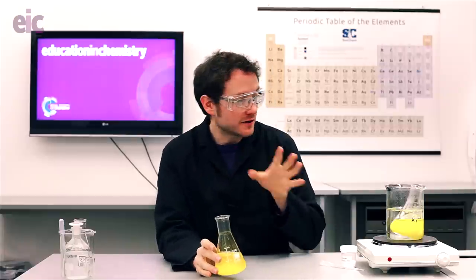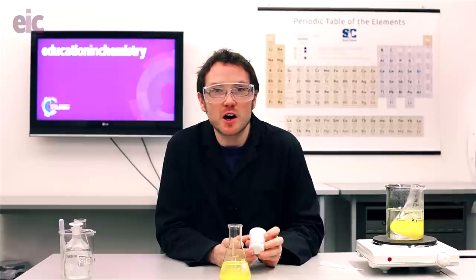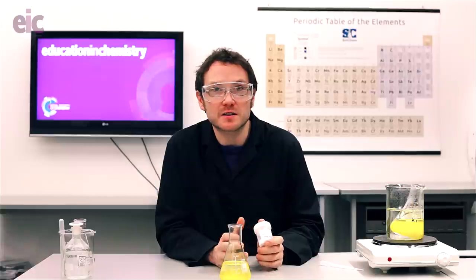Now, just talking very briefly about cleanup: when you've finished experiencing and enjoying that glittery goodness, your best option is going to be to add an excess of sodium carbonate. That's going to help to precipitate out any remaining lead as lead carbonate. You can filter through any remaining solutions to collect as much lead as possible, and then keep that aside to be collected by a licensed lead waste contractor.